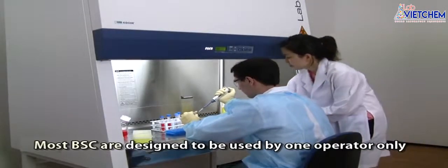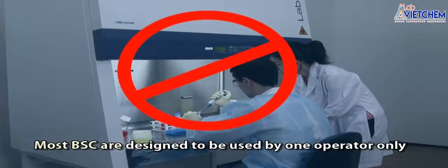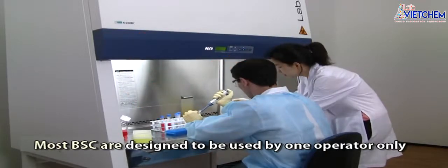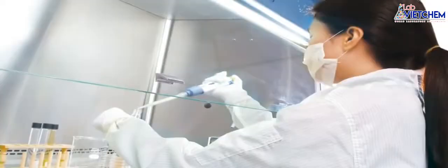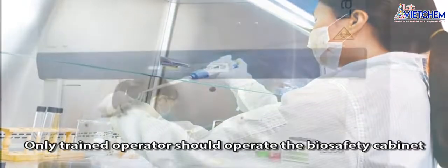Most biosafety cabinets are designed to be used by one operator only, unless specified otherwise. Any additional operator might break the air curtain and contaminate the materials. Only a trained operator should operate the biosafety cabinet.